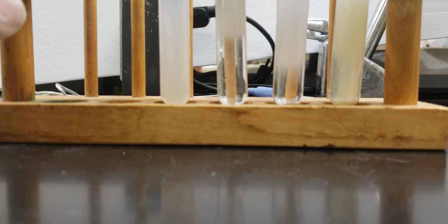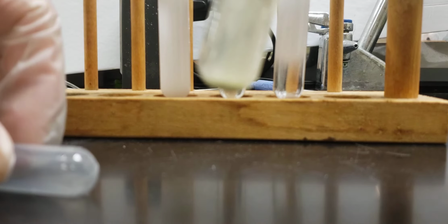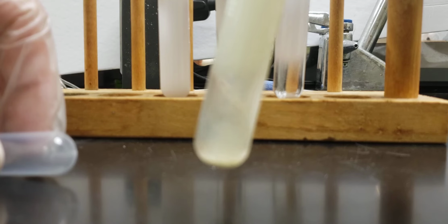All right. So in this case, we're going to go ahead and pour some into our first container, our second container, and our third container, and fourth. Okay. And when we do that, we'll go ahead and shake it up again. And we're going to see if the solution ends up getting a little bit lighter because there's more silver dissolving. Okay.